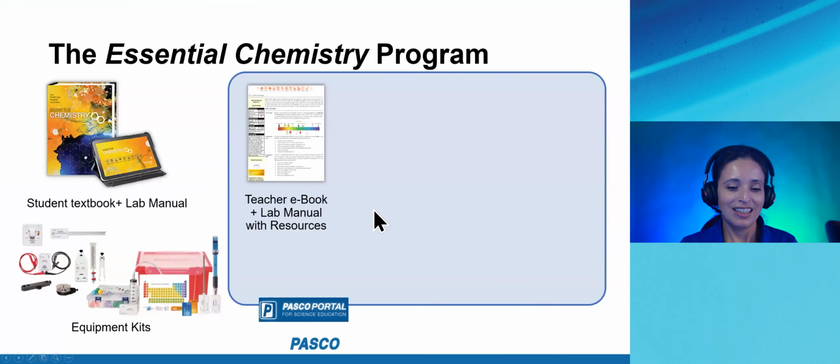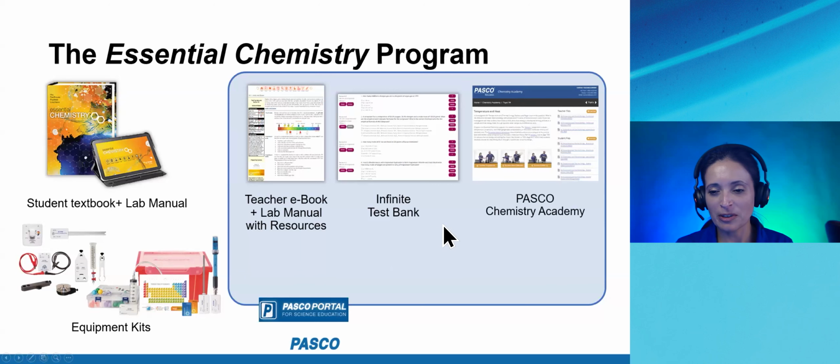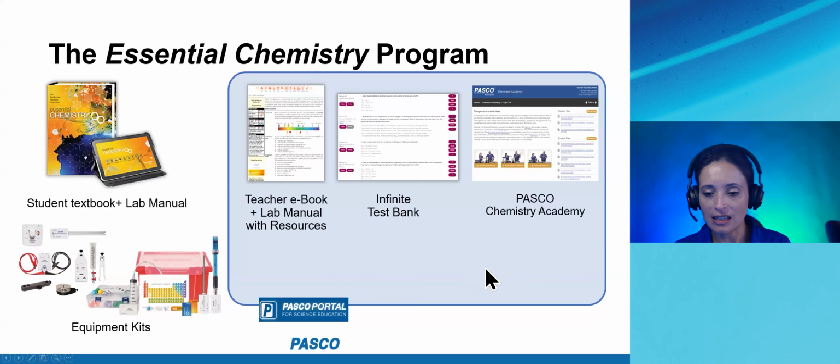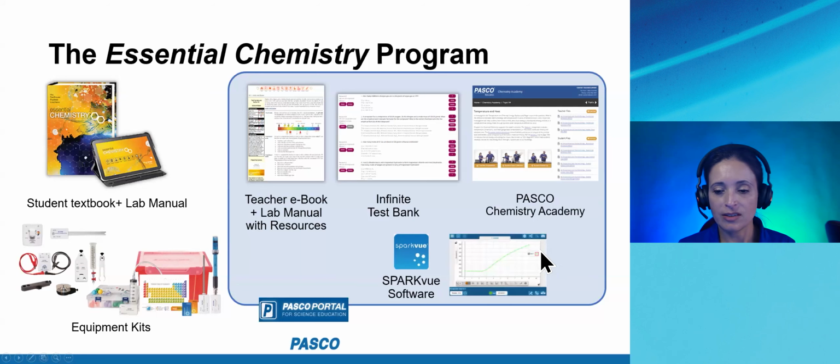Part of the Essential Chemistry program, we covered this in part 1 of the training, the infinite test bank. I'm not going to go over that today. PASCO Academy Chemistry, I'll review that if we have time. But there is information on this in webinar part 1. So check that out on PASCO's website under the training pre-recorded resources. Also, if you attended part 1, the recording will come to you if you signed up. Okay. SPARKvue is also part of the Essential Chemistry program.